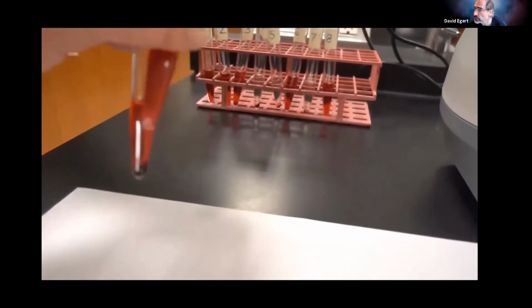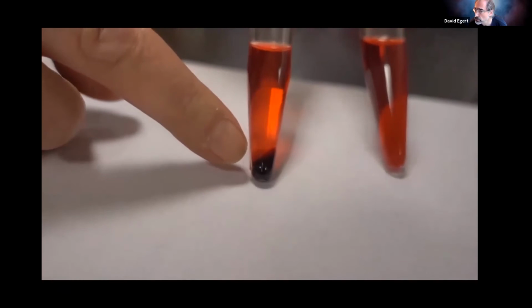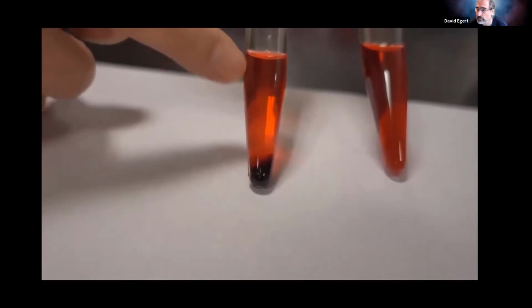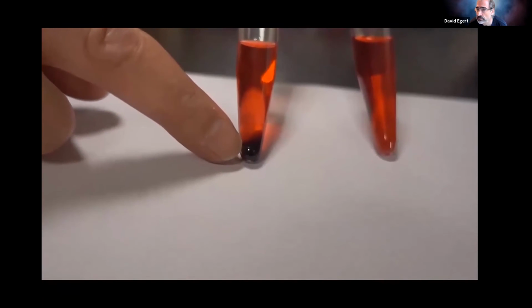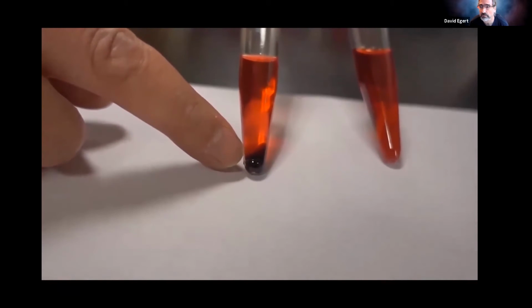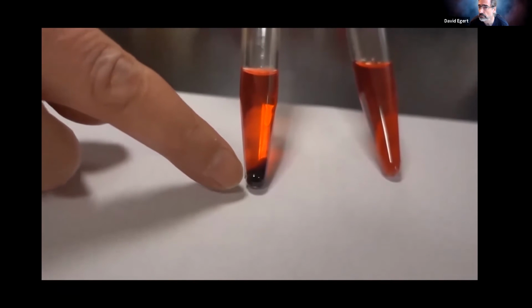And then finally we have the glycerol, and we have 2 different conditions here. We can start with this one here. This is the glycerol where the cells were only in for a few minutes before we spun them down. And we can see some of the cells lysed. There's red here. That means some of the hemoglobin escaped into the solution. But there's a pretty well-formed pellet, which is telling us a lot of the cells actually did not break apart and then got pulled completely down to the bottom of the tube.